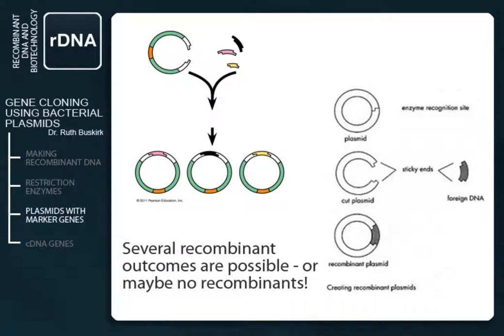Once we have our recombinant plasmid, we make the bacteria take up the new DNA through the process of transformation. However, a big challenge in gene cloning is to know whether or not our bacteria cells contain the recombinant plasmid. Some bacteria don't take up plasmids readily. Even if they do have plasmids, how do we know whether they took up the recombinant plasmid with the inserted gene or one of the original plasmids without the human gene?